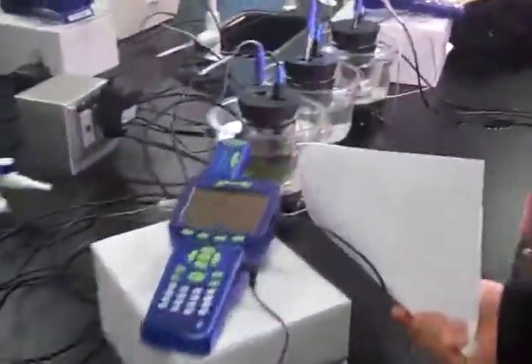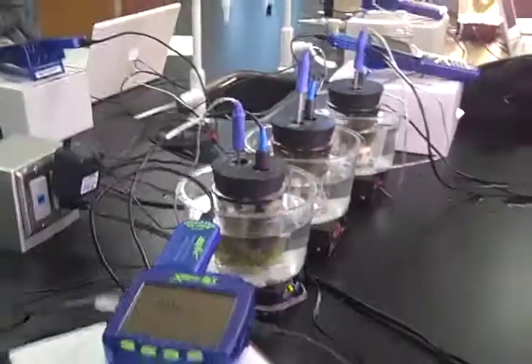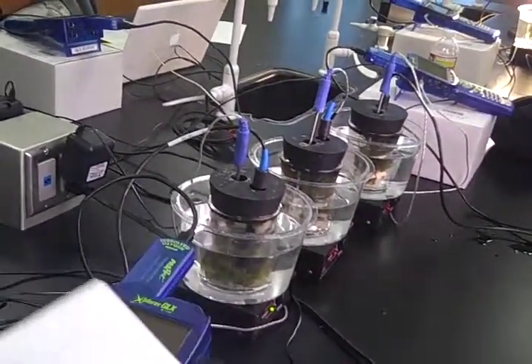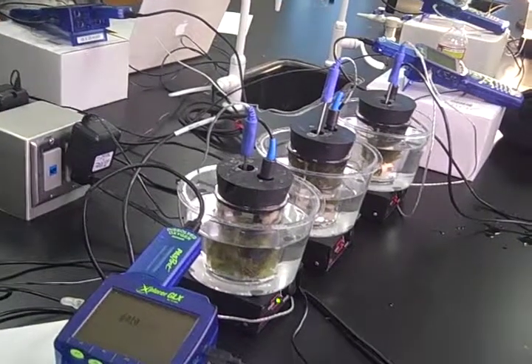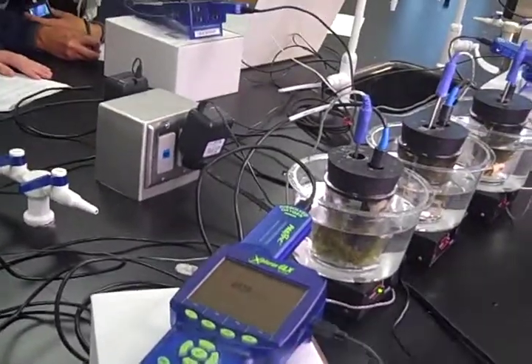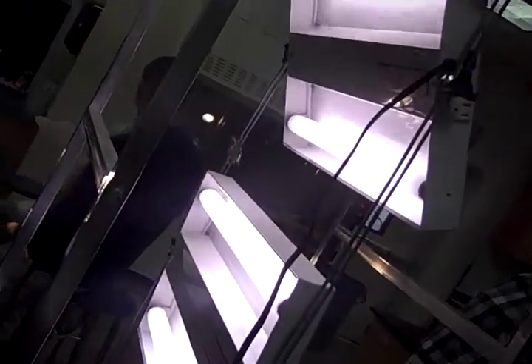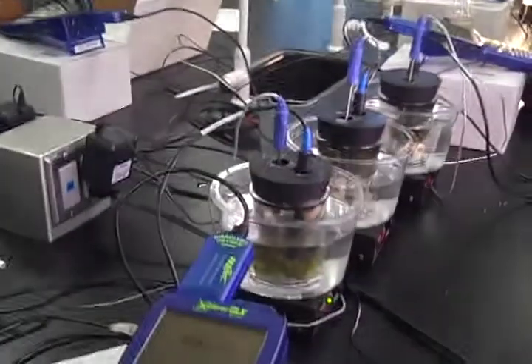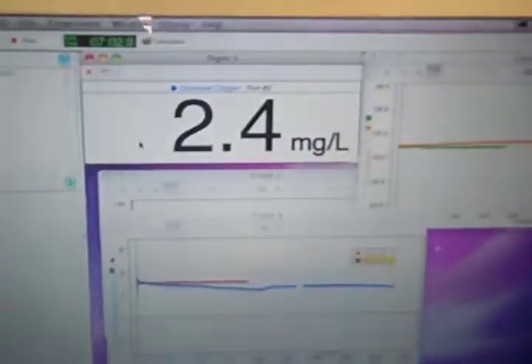This lab is done by initially finding the oxygen per gram of water inside. After we do that, we put in a plant that goes through the process of photosynthesis. In this case, it's Elodea. After we record the water, we record the plant with the water inside to see how much oxygen is produced. And obviously you see here, for photosynthesis, all the needs are provided, like light and water, so it'll create oxygen. And then here are graphs and data that we are recording.